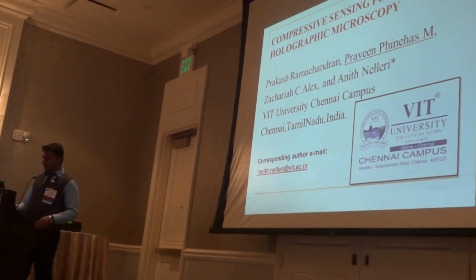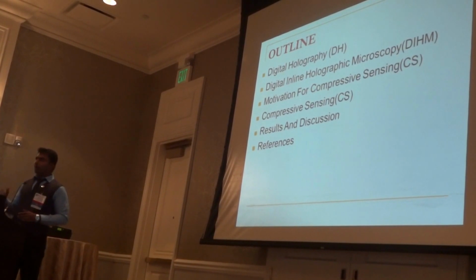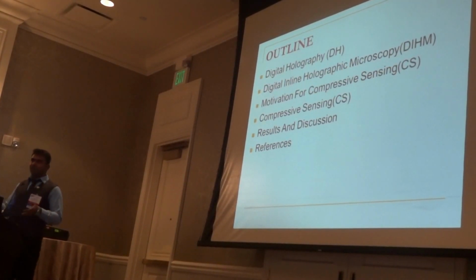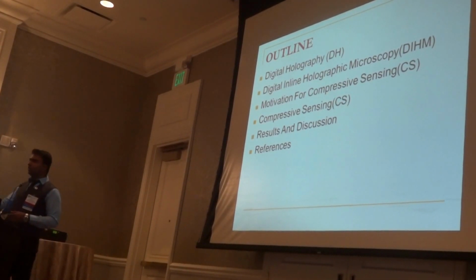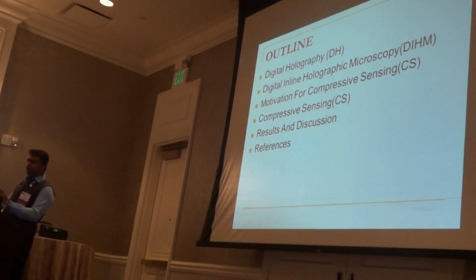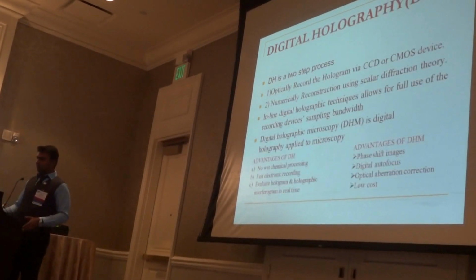I'm the presenting author and the second author of the paper, Compressive Sensing for Digital Holographic Microscopy. The general outline of the program will be like, I'll talk about digital holography and why I use digital inline holography microscopy, and the reason I applied that for compressive sensing, and what compressive sensing is in general, results and discussion, and finally my references.